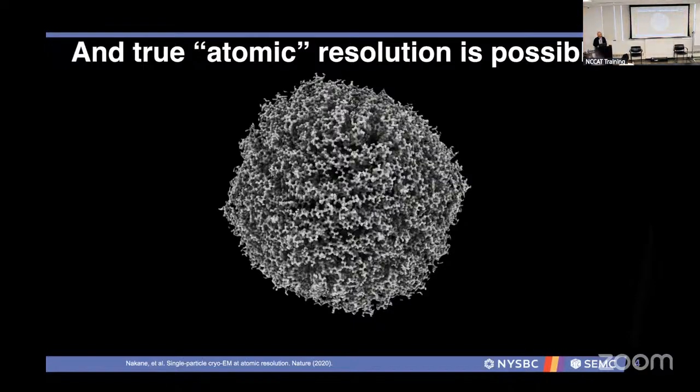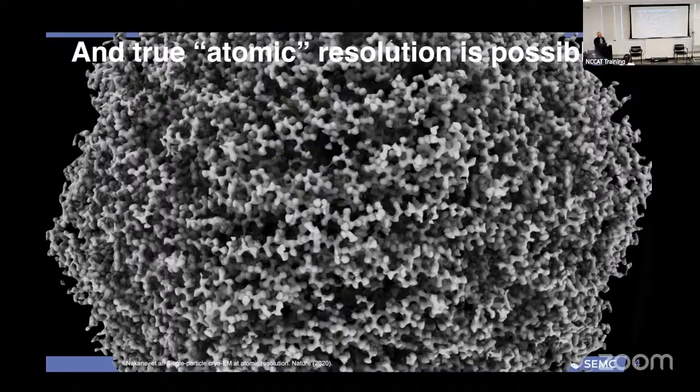But the root goal for all our sample preparation techniques is to see if we can access as high resolution as possible. And atomic resolution has been used as a proxy because it's very useful as a metric to determine quality, to, by first principles, have validation, and as well as gives you enough buffer cushion to start answering some biological questions. It's always nice to say, I only need 5 angstrom resolution, but I'm at 1. I would prefer to have that buffer, and that removes some shadow of a doubt in terms of your analysis.